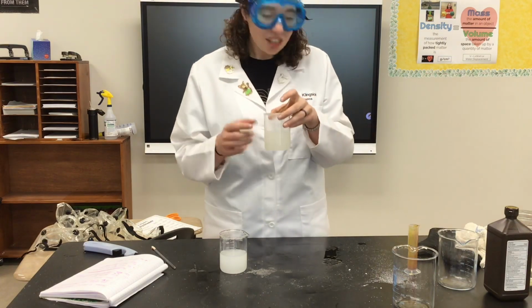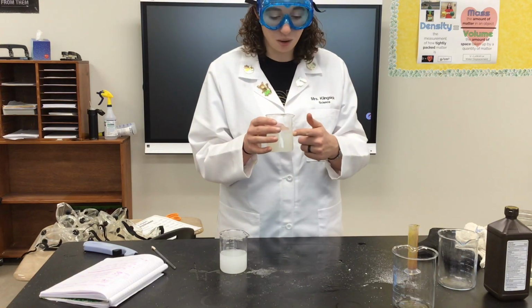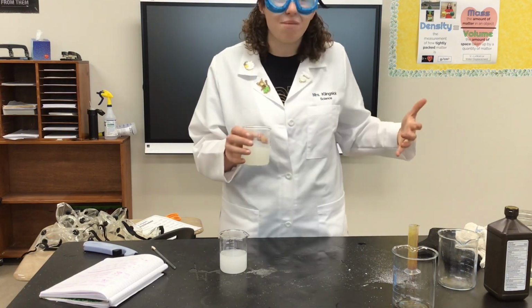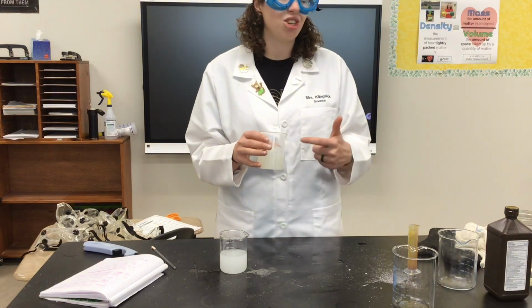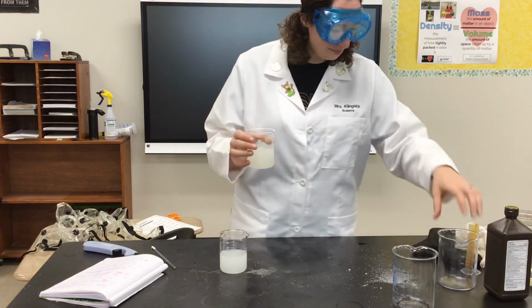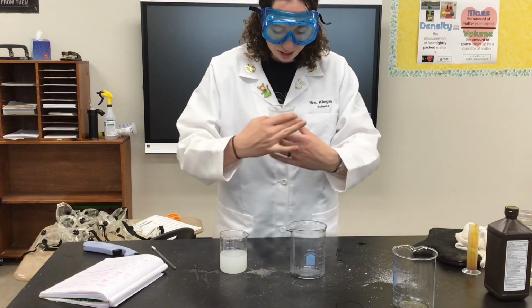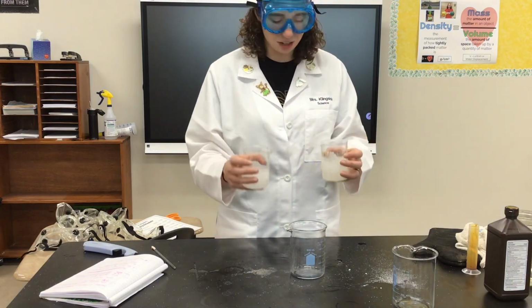So what actually has happened is the iodine is reacting with the citric acid and the water, so it doesn't actually disappear. It's a chemical reaction. So we just saw a chemical change. That iodine had a dark color and it changed to a clear color because of its reaction with the citric acid. All right, so now I'm going to add this mixture into this mixture in this cup.